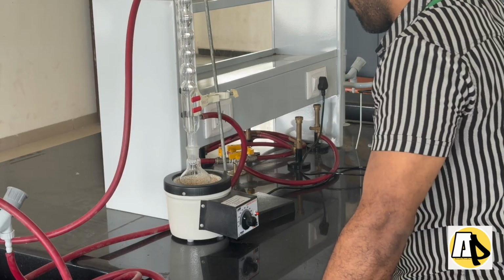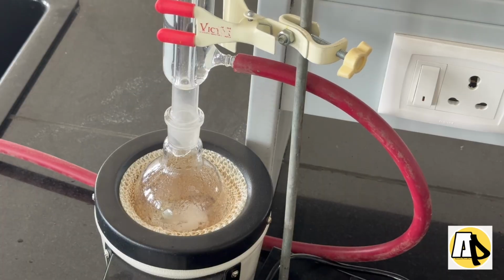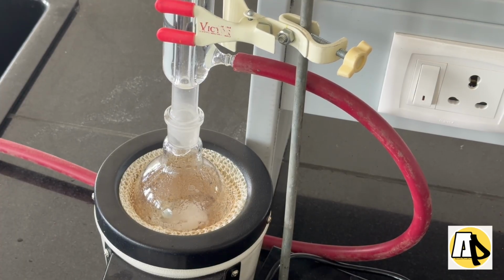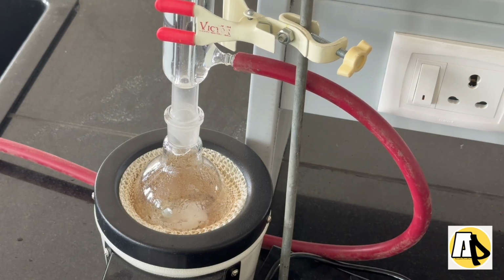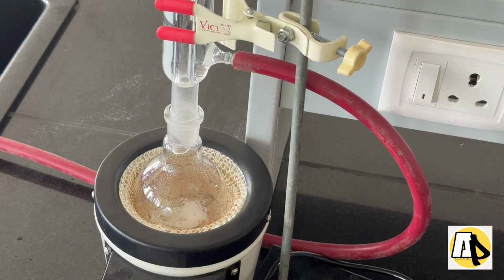And yes, you can see a white colored solid in the RBF, and the refluxing is happening already, heating is happening, and it will eventually get refluxed also. So what is getting refluxed is ideally the methanol. So let us continue it for 20 minutes, and after that you will see total liquid without any solid in that.